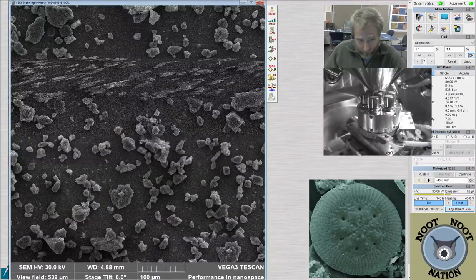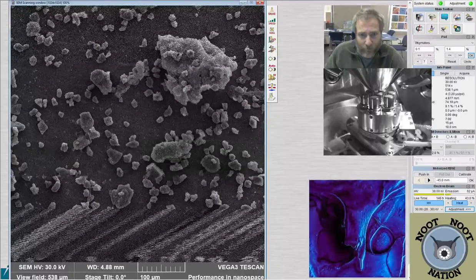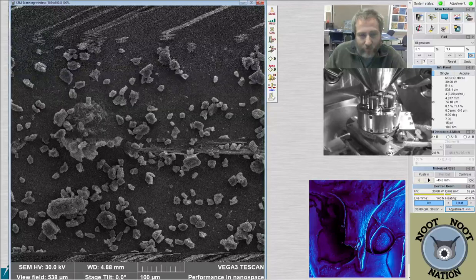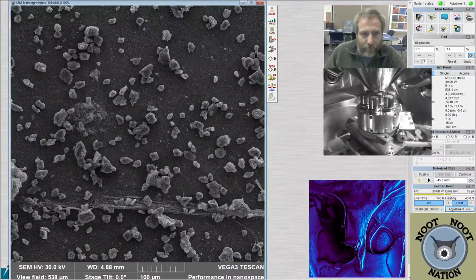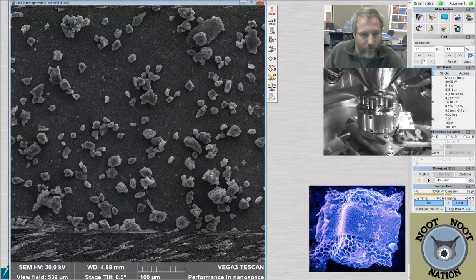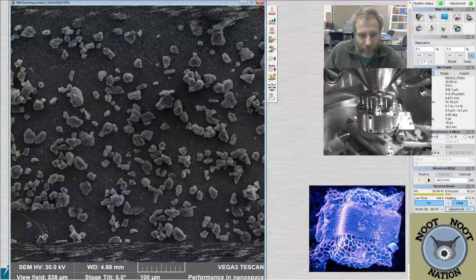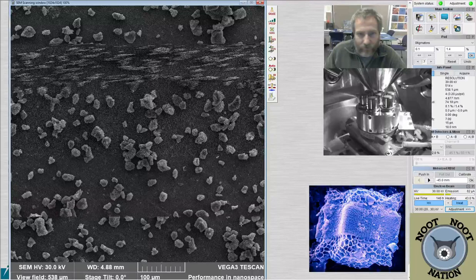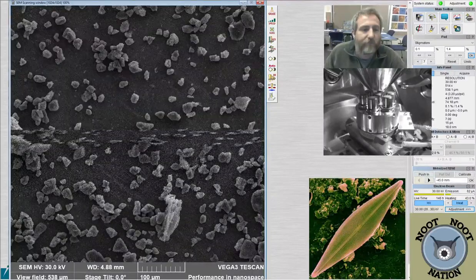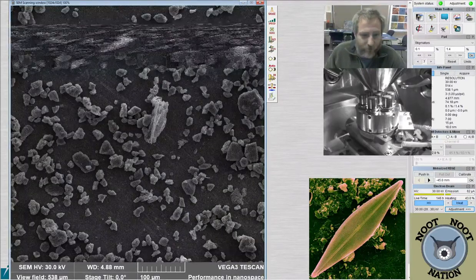fragments of diatoms present. A scanning electron microscope stub is smaller than a typical microscope slide, though. So we usually see a little bit less material, maybe a third or a quarter of the size. So it's sometimes challenging to get enough material on there without it being so clumped and dense that you can't actually see anything. But these are mostly silt. This one is for sure.